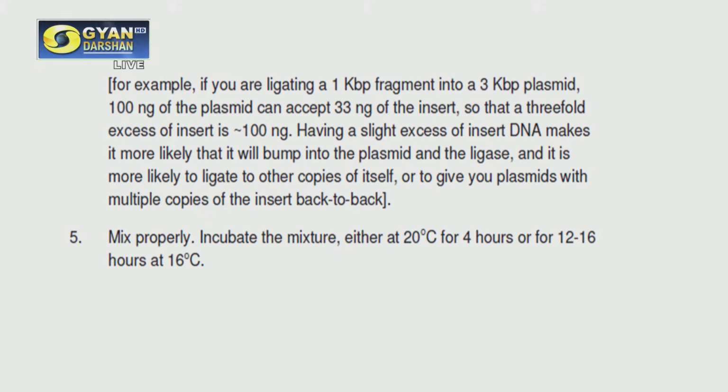If you are ligating a 1 kilobase pair fragment into a 3 kilobase pair plasmid, okay, so the plasmid is 3 times larger than the foreign DNA. But what we need is, we need the foreign DNA. How much excess? 3-fold molar excess. Because we said 3:1.